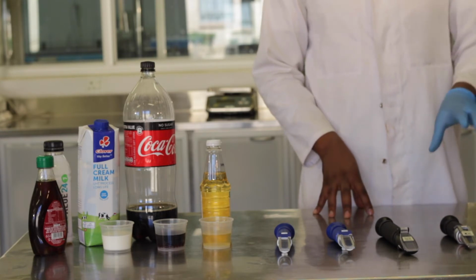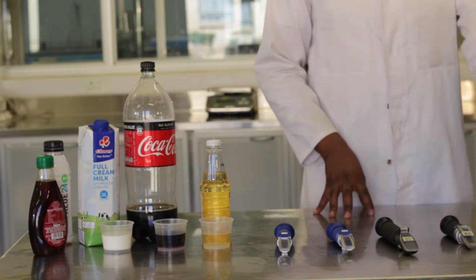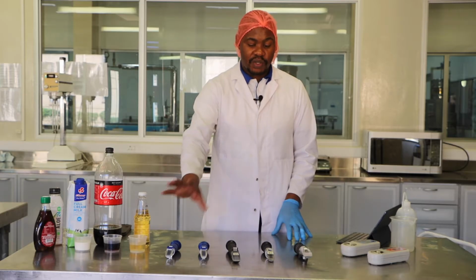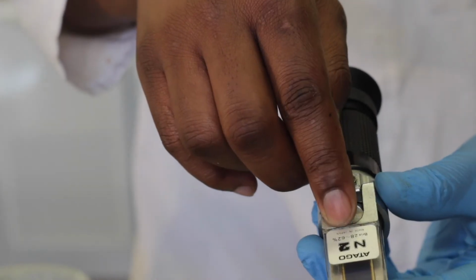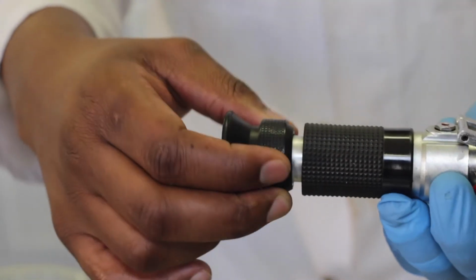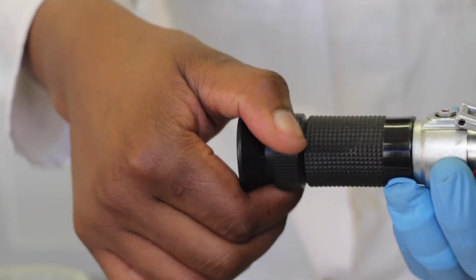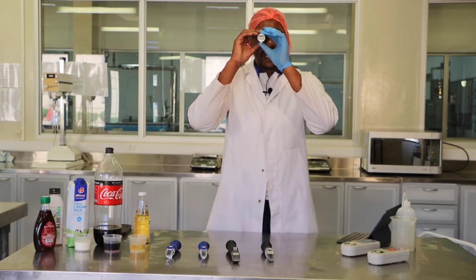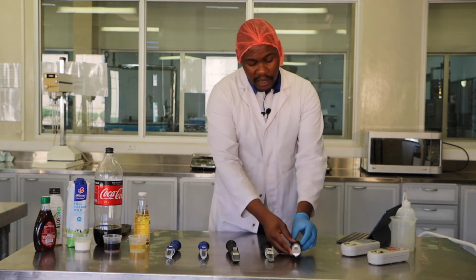We have in some cases refractometers that only measure sugar, and we also have refractometers that can also measure salt concentrations. For example, the refractometer that I have here can measure sugar concentrations. And how would I establish that? If you check the refractometer on the inside, you can see the scale there, Brix or percentage mass of sucrose.